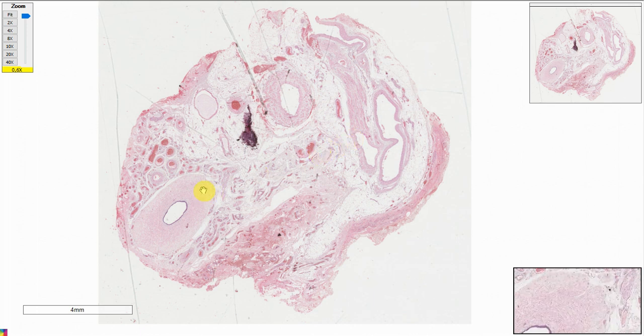These include the vas deferens, which is what we'll look at in detail, a pampiniform plexus of veins, the testicular artery, and cremaster arteries. We also have the genital branch of the genitofemoral nerve. I'll show you the nerve structures, but we won't know for sure if it is the nerve in question, because we need to look at it from a gross anatomy perspective.